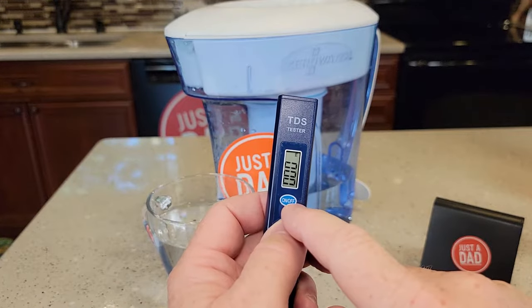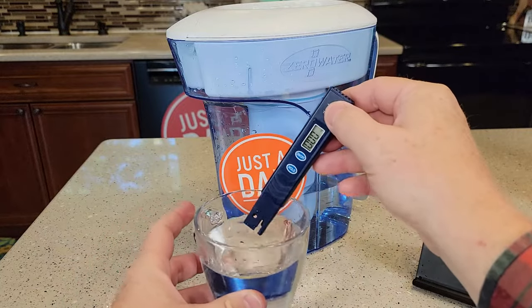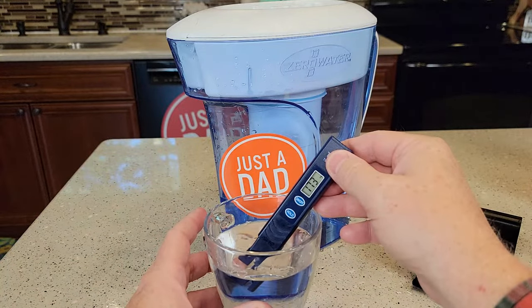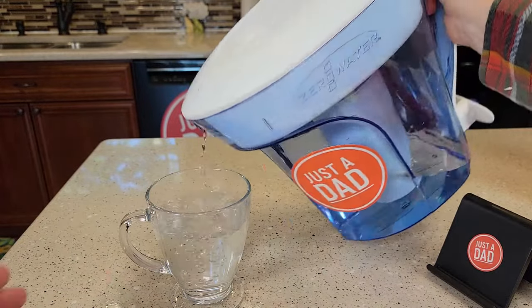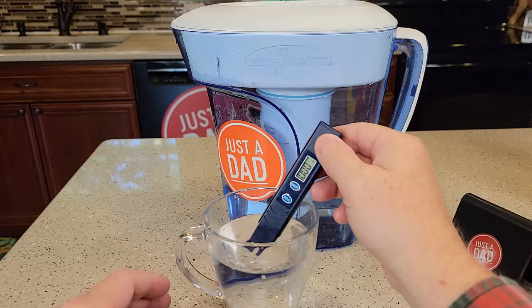It's very simple to use — just turn it on. It's going to start off with a zero reading. Then you put it in your water. This is my water out of my tap. You can see it's really high — it's got 172. Now let's run that same water through that Zero Water filter and then check it. Zero.